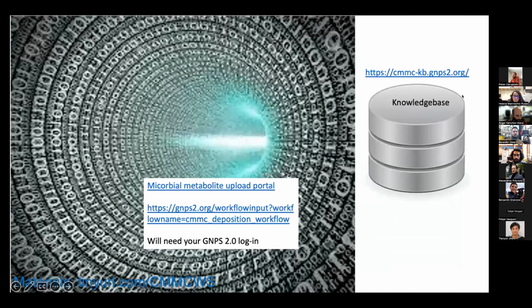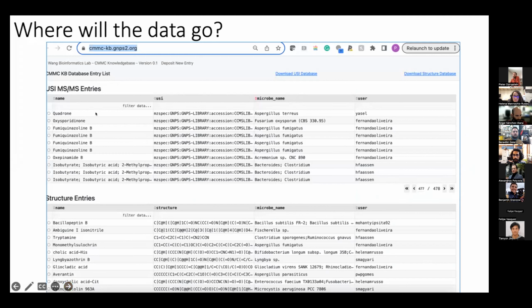So then to access the knowledge base, there's a link here to access the knowledge base. You can actually download it, but basically there's two forms of download that you can have. One of them is focused on the MSMS spectra. So if you want to download all the MSMS spectra, linked to the different compounds, you can click on this download USI database, and you can get all the information that's attached to these particular compounds. Here you can just search if you wish based on a compound name, microbe name, or user. There's also the structural entries. If you want to search based on SMILES, you can do that as well. So basically the idea is that anybody can download the database and use them in third-party tools if they wish, just to make it easy for the community.